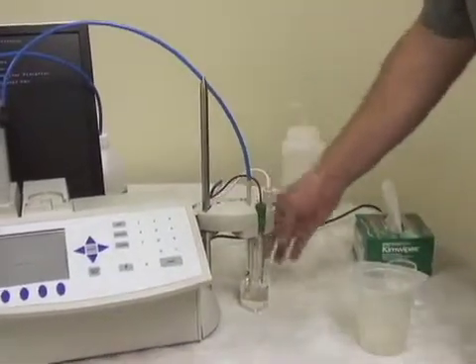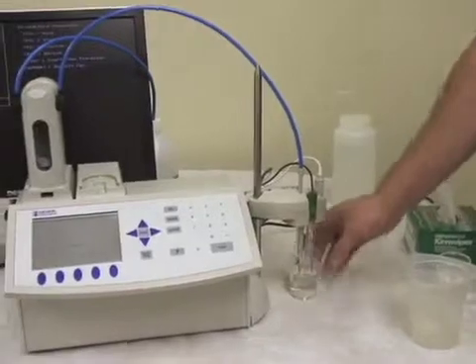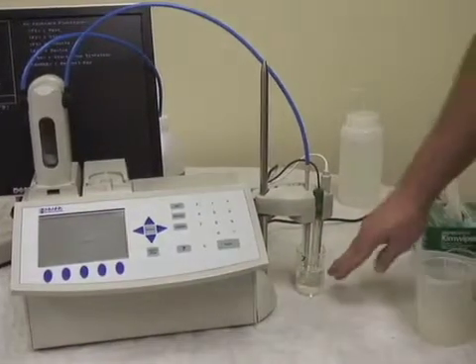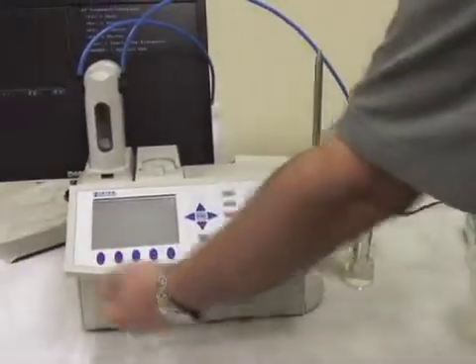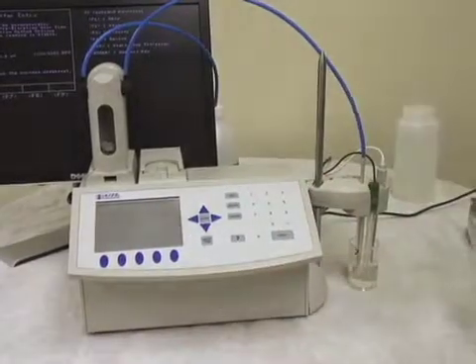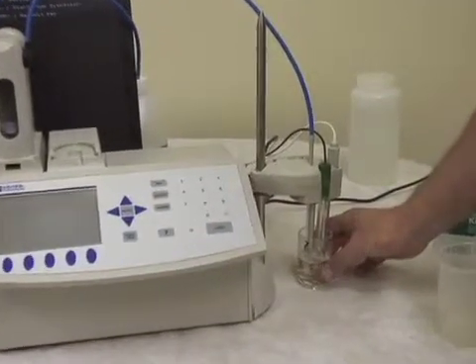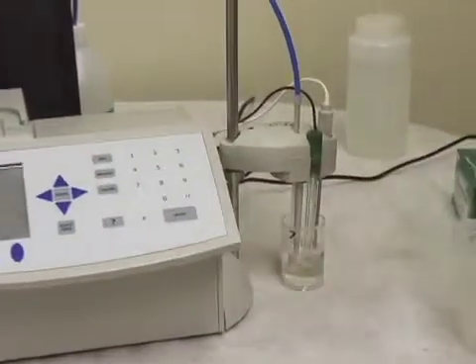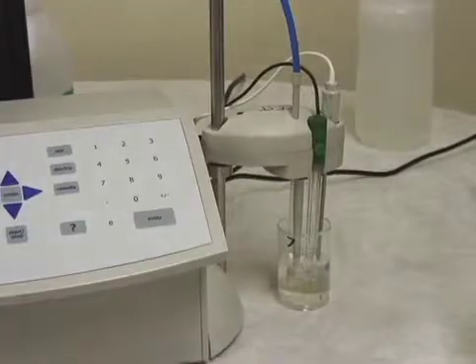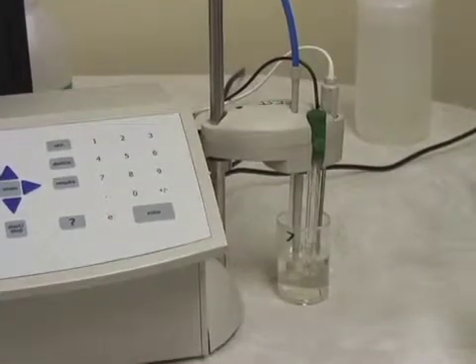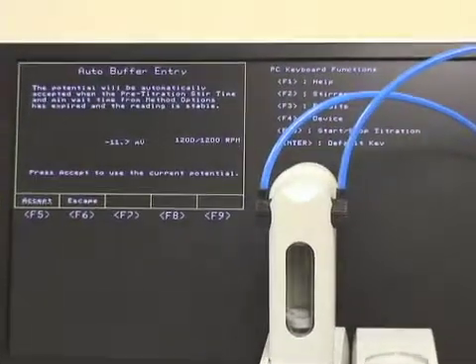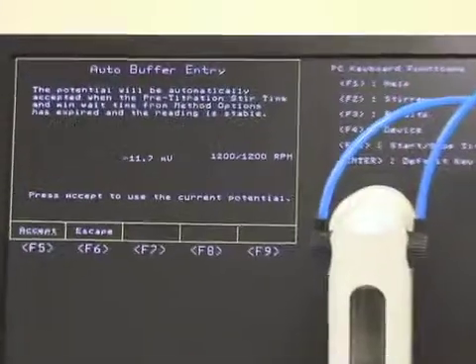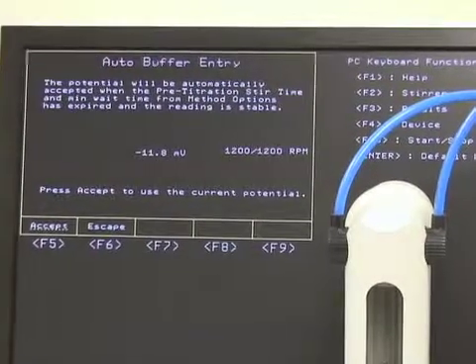We've already cleaned our probe and stir bar, which is critical for all pH calibration — you always want to clean and dry the stir bar and probe. Once it's in there below the junction, simply hit accept. The machine will stir for 10 seconds and then take a reading, as long as it falls within a certain set of parameters, it will go back to the pH menu with the buffer entry recorded.